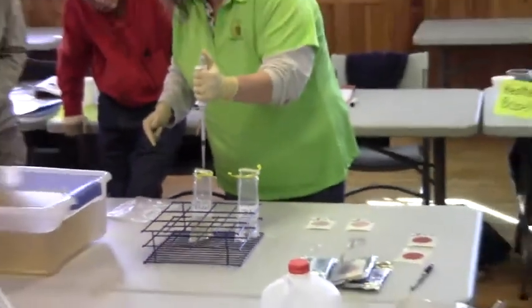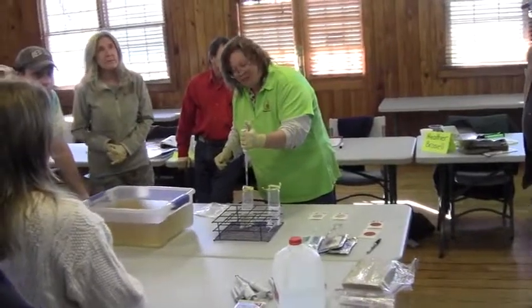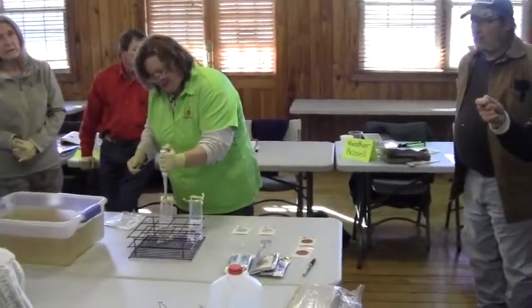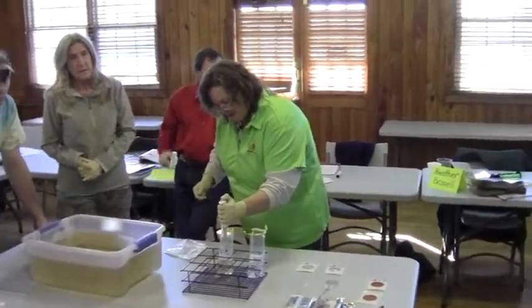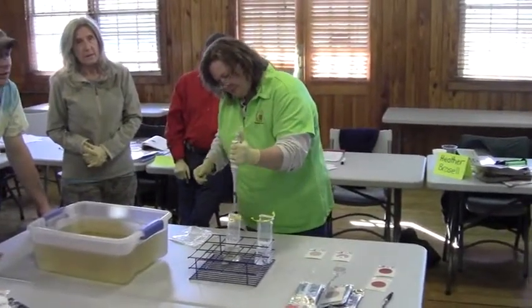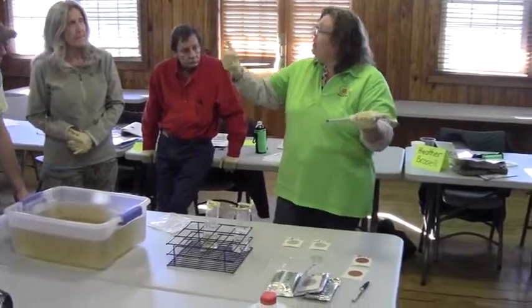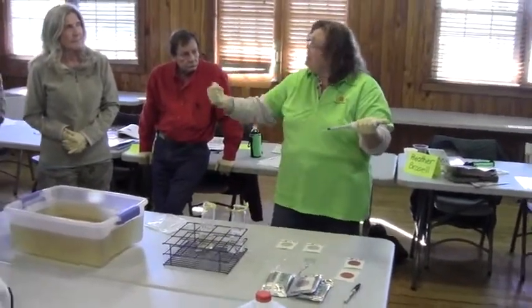Drawing your sample up right here, the step that Julie's demonstrating. How far are you pushing it down? To the first stop. Not the second stop, but the first stop when you draw — the first stop to draw, and then the second when you deliver. When you feel it, you'll feel the first stop and then the second stop.